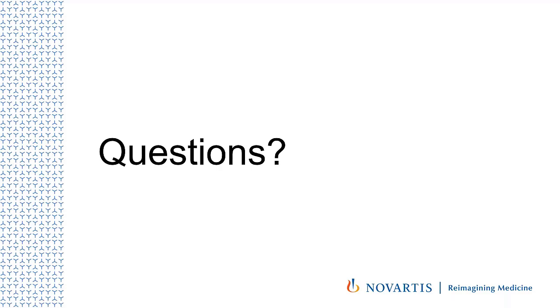Our needs actually evolved during our request. At the beginning we had an idea just to somehow make things faster and easier. But while we were doing it and liking what we were seeing, we were adding more and more stuff. So I don't know, more than a year, Mitch? Yes, I think for sure a year, or maybe nearly 2.